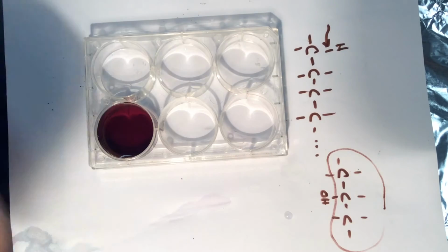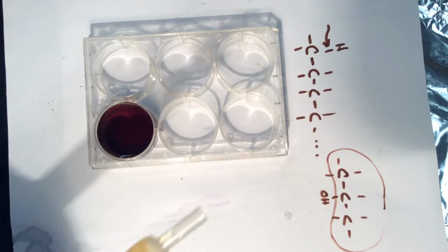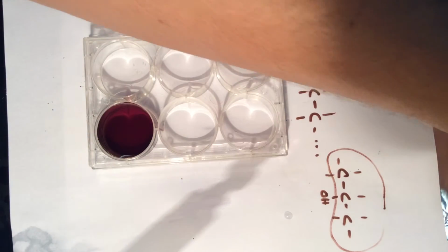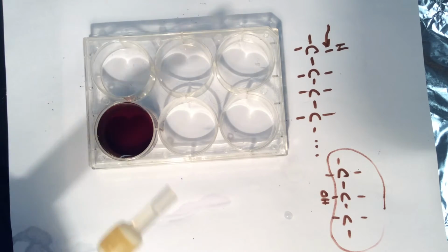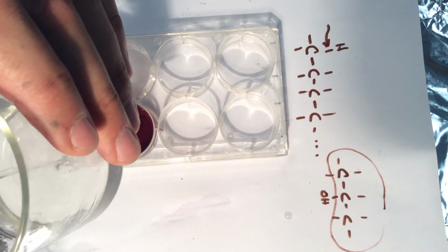the isopropyl. Isopropyl has components of both. Water is clearly mostly polar, although it does have some non-polar characteristics, London dispersion forces. However, I'm going to push that out. So I flooded it with the 70% isopropyl alcohol to clean out anything that had any attractions to that. And now I'm going to flood it with the water.